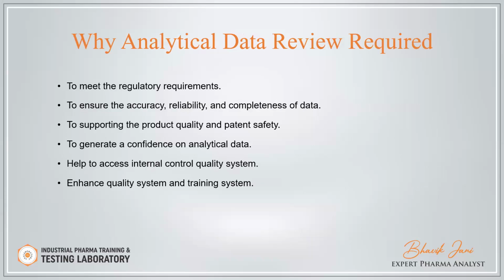Why is the analytical data review required? To meet the regulatory requirement, to ensure the accuracy, reliability, and completeness of the data, to support product quality and patient safety, to generate confidence in the analytical data, to help assess the internal control and enhance the quality system and training system.